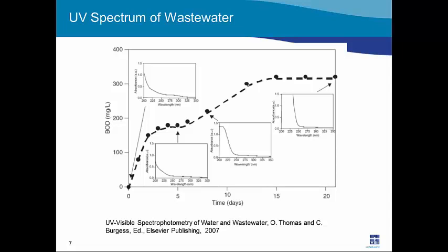As we moved on past those 5 days, if we kept some bottles going, we would see that in 8 or 10 days or so, we might have a curve that looks like the one in the middle, where there's actually a very high peak on the left-hand side around 200 to 225 nanometers. That is the area where nitrate absorbs. So you're getting nitrification in the bottle. Nitrate is going up. Of course, the organic contamination is going down, so there's a very low signal from that.